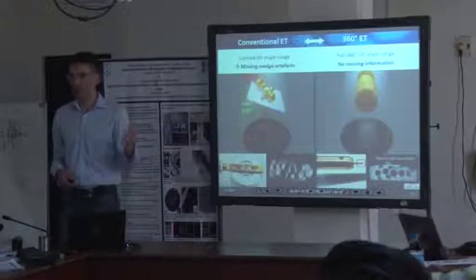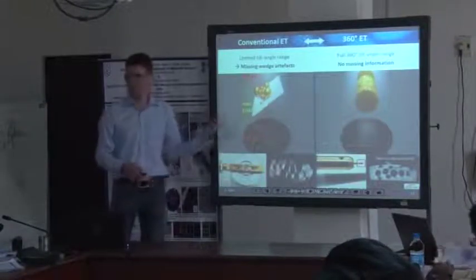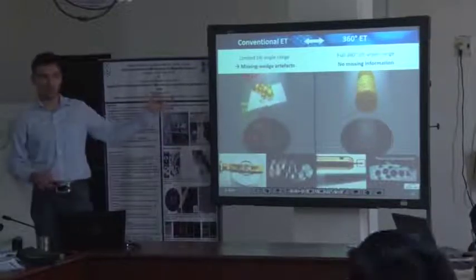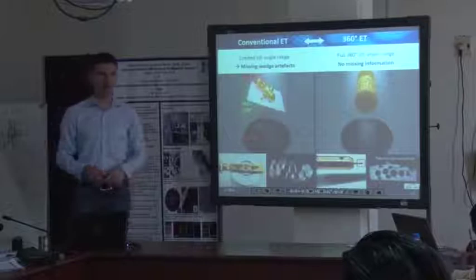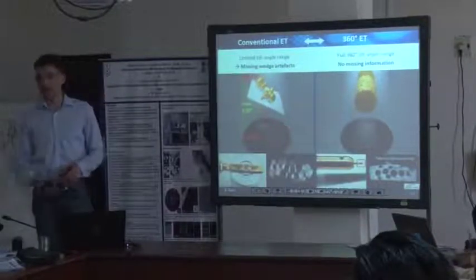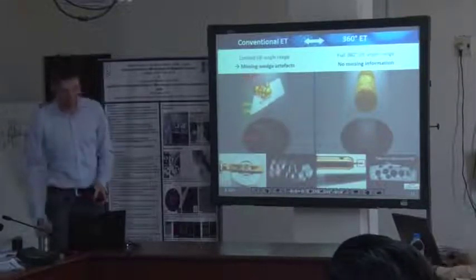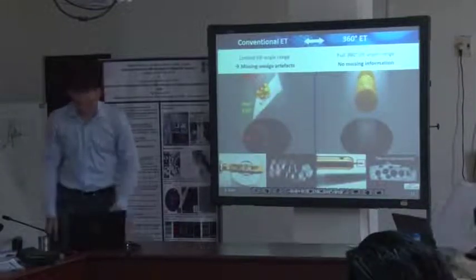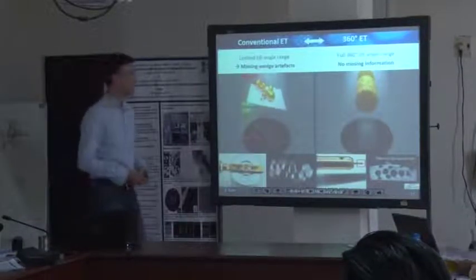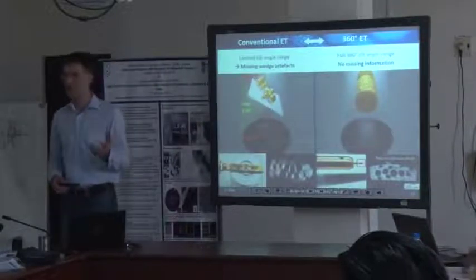There are pretty many viewer tools available, and if you have a model which you can easily generate, you can do such rendering and three-dimensional, fancy visualization of any model in material science or any technique. I just wanted to comment that whenever you aim at a publication, you have to deal with the quality and appearance of your data.